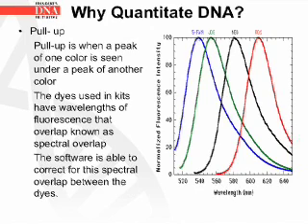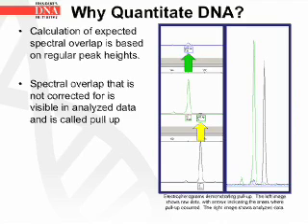Now let's go into pull-up. Pull-up is when a peak of one color is seen under a peak of another color. The dyes used in the kits have wavelengths of fluorescence that overlap, and this is known as spectral overlap. The software is able to correct for the spectral overlap between the dyes. From the graph, the areas in common to the dyes are the areas where spectral overlap would occur. The closer the dyes are in their wavelengths to each other, the more spectral overlap occurs. The calculation of expected spectral overlap is based on regular peak heights; the spectral overlap that is not corrected for is visible in analyzed data and is called pull-up.